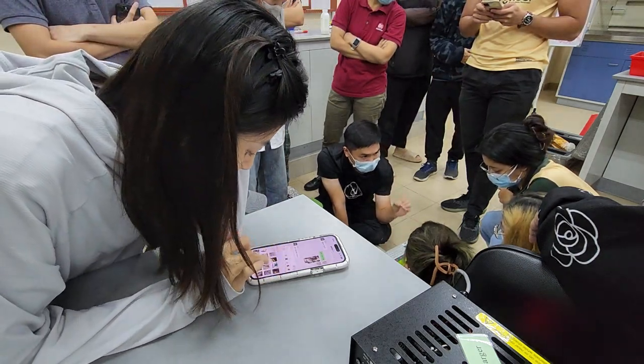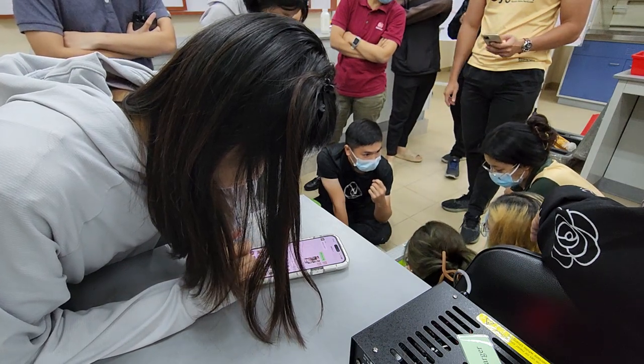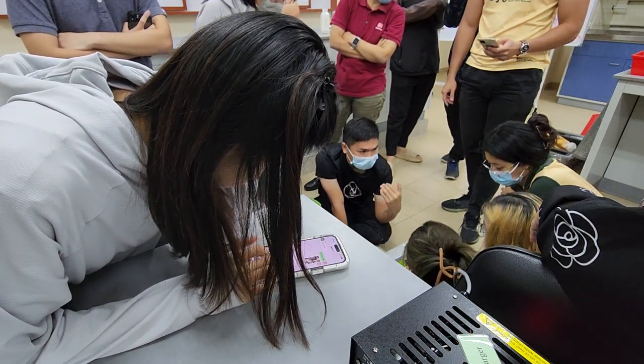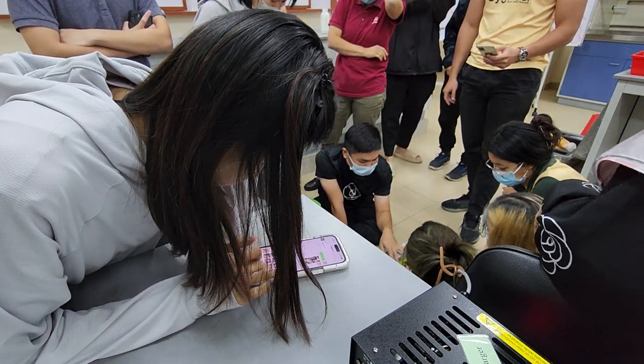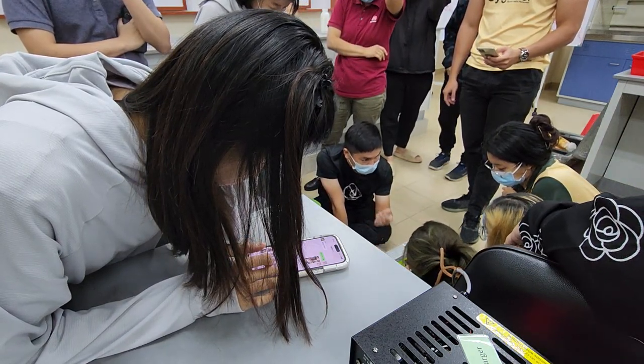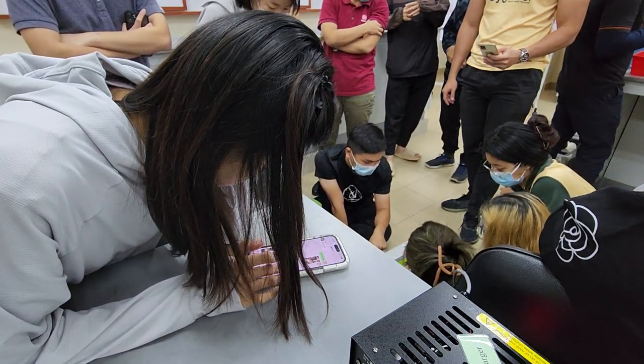Conductance is stomata conductance. This one I think is specifically to water vapor. Stomata conductance can be to other things, can be to oxygen, can be to carbon dioxide. For this one I think it's to water vapor. So just assume it is stable now.